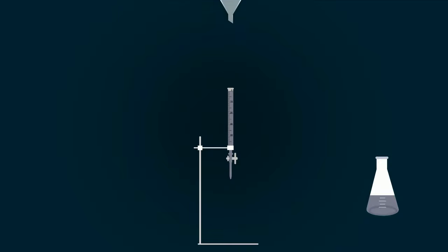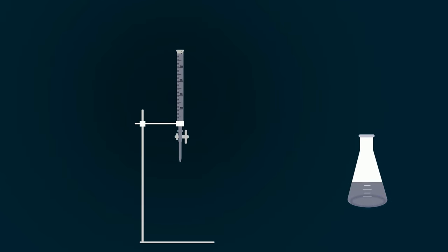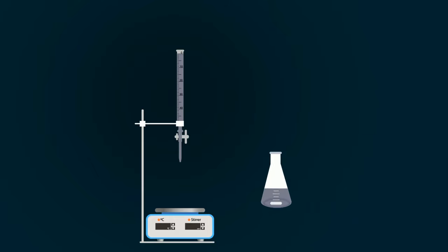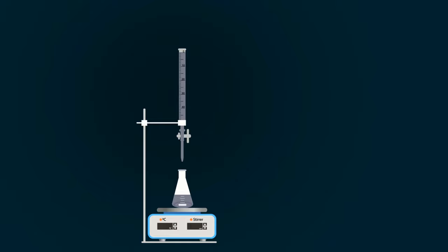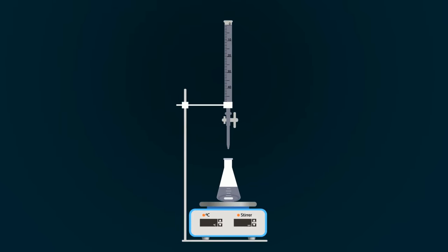Now put magnetic stirrer and add magnetic bar into the conical flask. Put this conical flask onto the magnetic stirrer. Now adjust your RPMs.